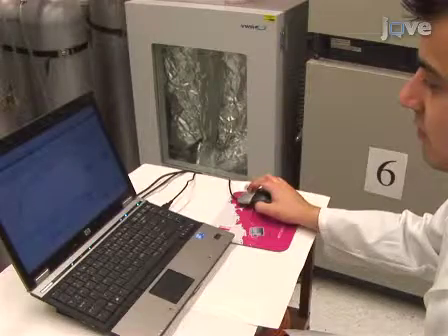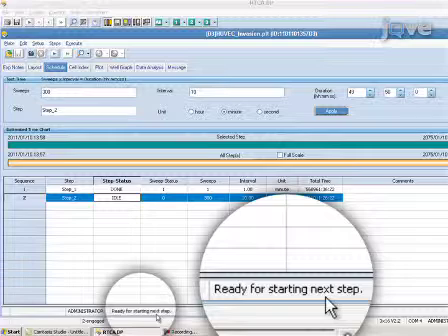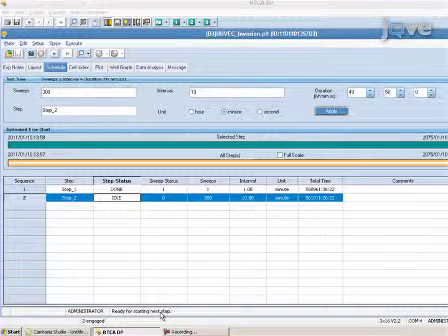After the background measurement has been performed, the window displays the message: Ready for Next Step. Please click Next Step to start. At this time, cells can be added and the formation of a monolayer can be monitored, as described in the next section.